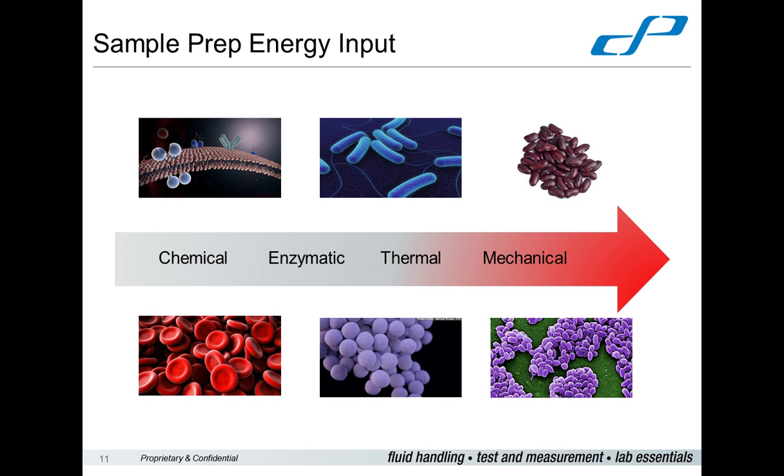So a trade-off must be found between lysis efficiency and protection of the important biomolecules found within. And often the trade-off must be found empirically, experimentally, and by the accumulation of evidence. And because this is biology, samples come in all shapes and sizes, and there's very rarely a one-size-fits-all protocol.